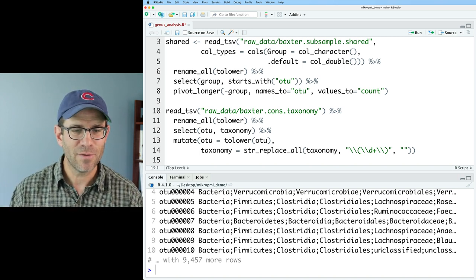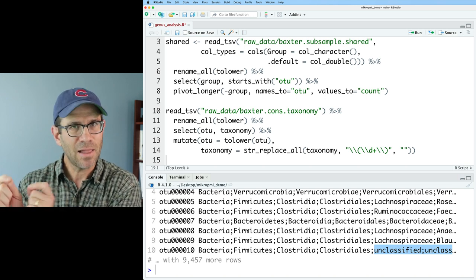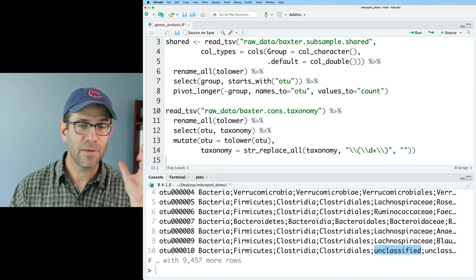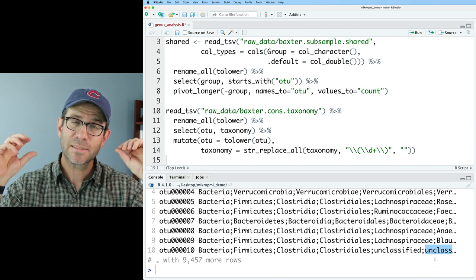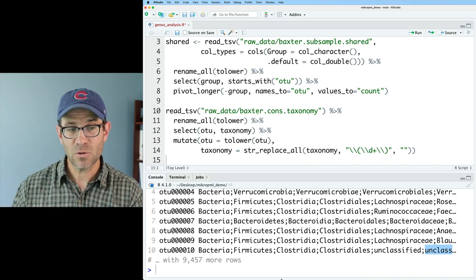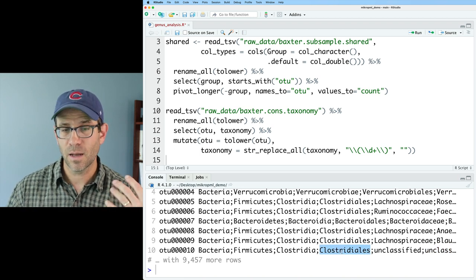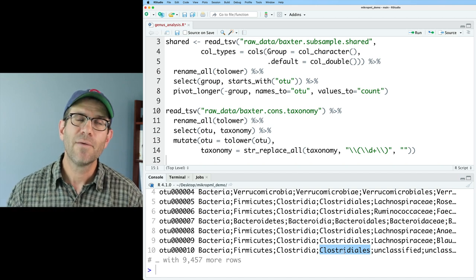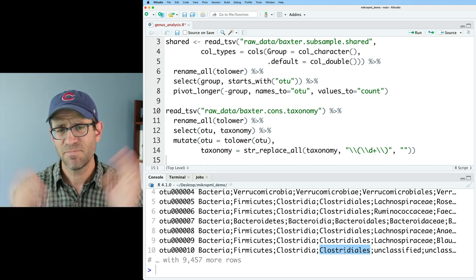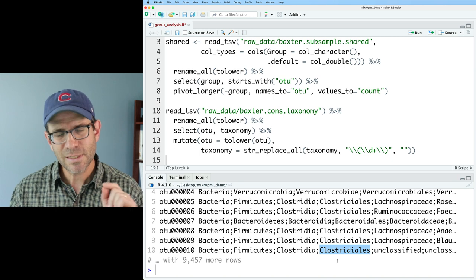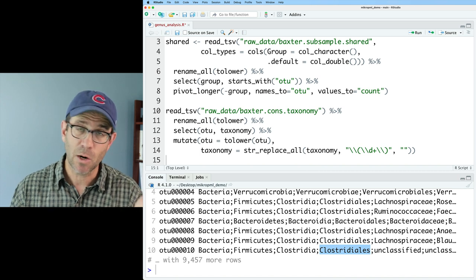One thing I noticed is that the data from the version of mothur I was using has 'unclassified' as a family name and genus name — for example for Otu210. So if I cluster things by genus name, the genus name is going to be 'unclassified'. I'd rather it be something like 'Clostridiales_unclassified'. If you look at output from newer versions of mothur, we do that automatically, but we're going to do that here in R. It's going to take a little bit of trickery — this might take a few str_replace_all commands.